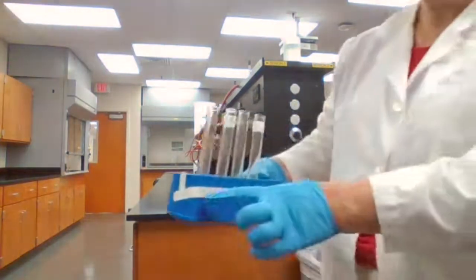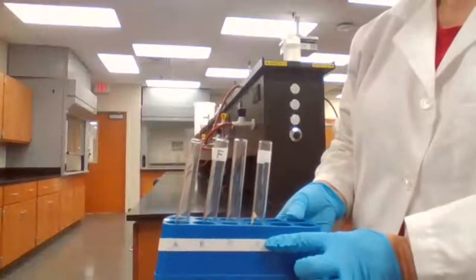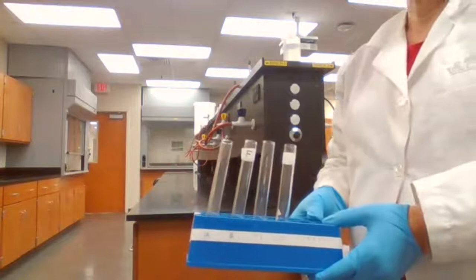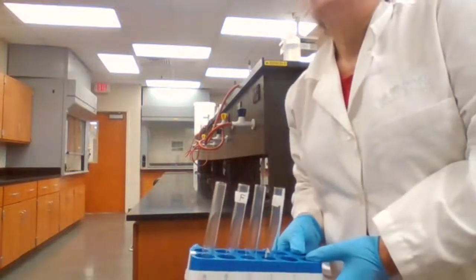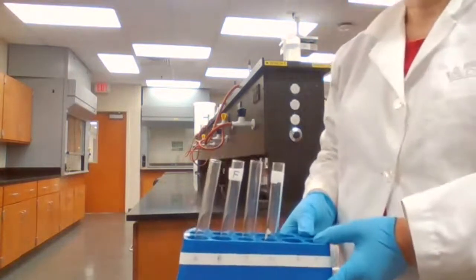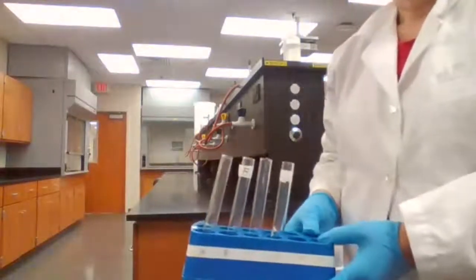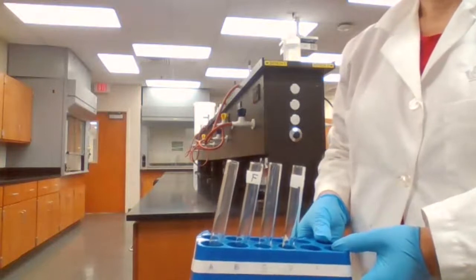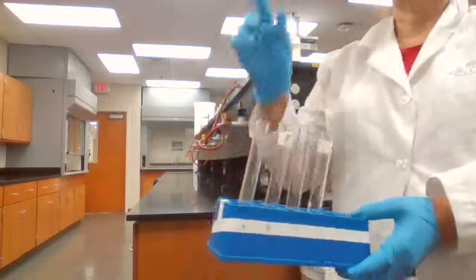And they are labeled A, B, C, and D. What is my next step? 5 drops of each of the unknown. And what else? And we want to add 20 drops of the reagent.